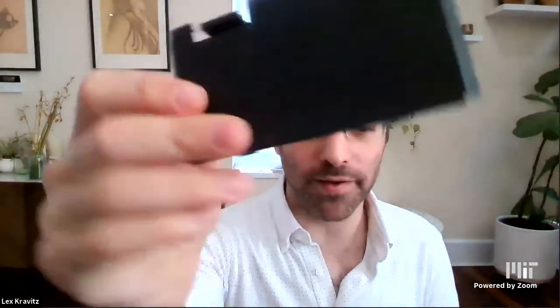So we've been 3D printing this ourselves using not very expensive printers, so regular filament-based methods. That's how we started. People that have been using it have printed with a range of printers. Eventually we're migrating towards using commercial services online that have much higher quality printers than we could afford. These are usually SLS printers that make beautiful parts. I have some parts here that are just perfect kinds of parts.